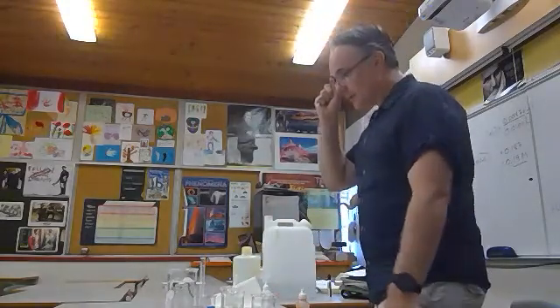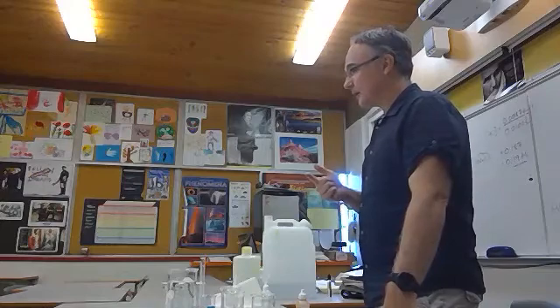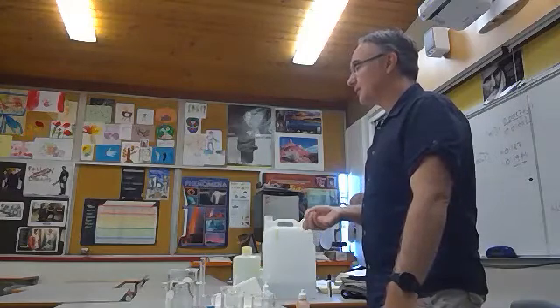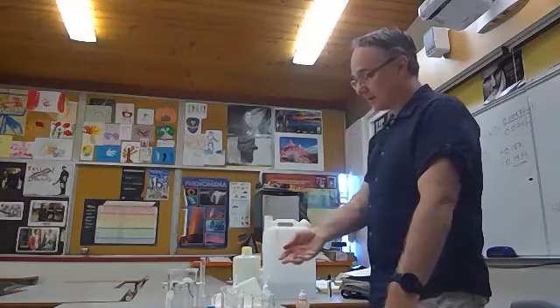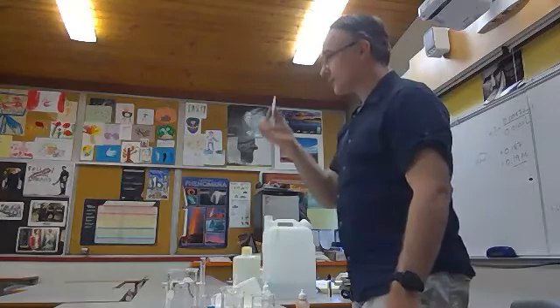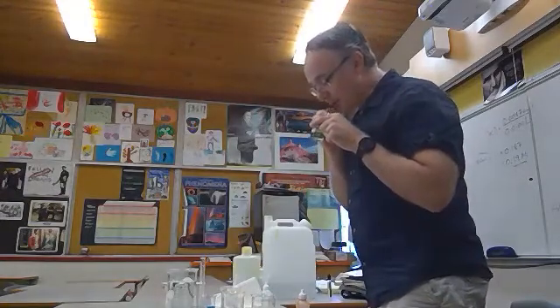And so at the end of the chapter, we study oxides. So we look at metal oxides and non-metal oxides. Things like nitrogen oxides and sulfur oxides tend to produce acid rain. But I can actually produce acid in here because I exhale CO2. So if I just take this little straw that I made for myself, and I'm not going to drink it, because that would probably make me very sick, I blow into it.